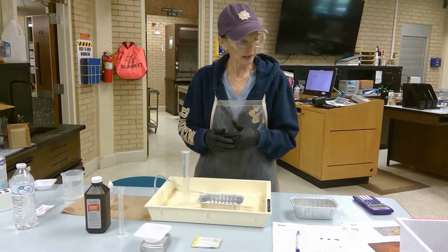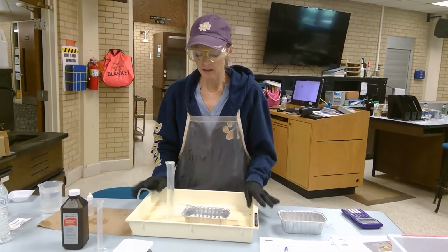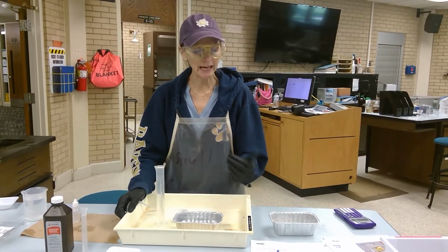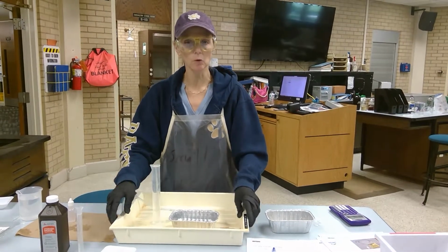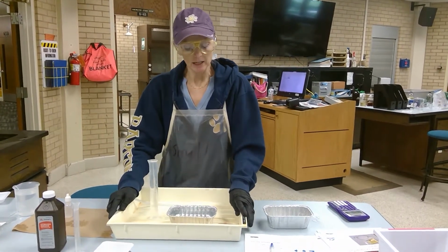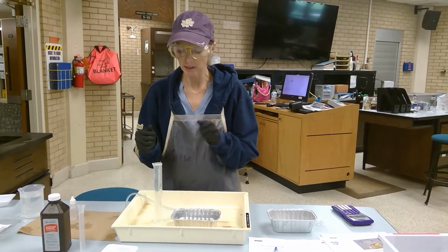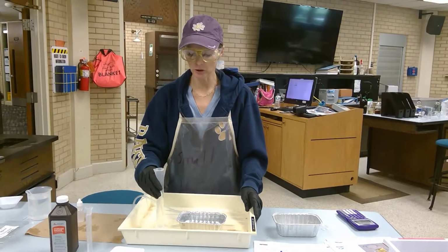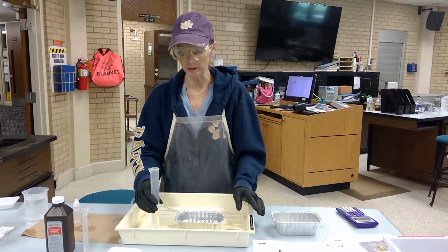Now, I am going to do some improvisation based on this lab. This lab's a little bit messy, so if you have a cake pan or a disposable cake pan, you'll probably want to use this because you will be working with a lot of water and trapping gas, and you'll need to flip over your graduated cylinder, which I have filled all the way to the top with water.